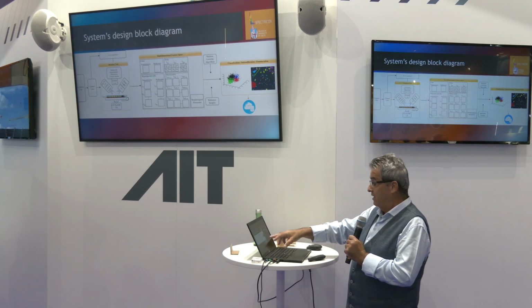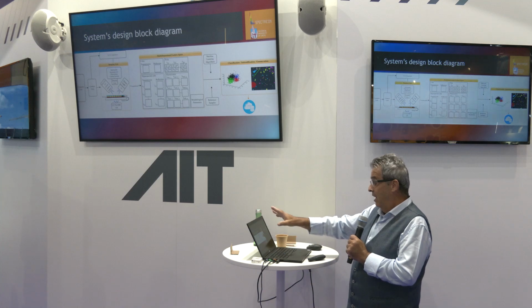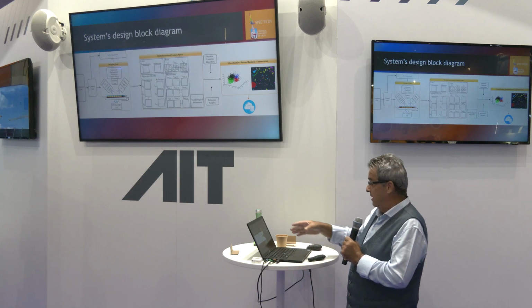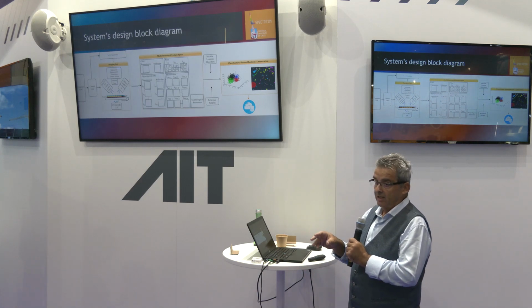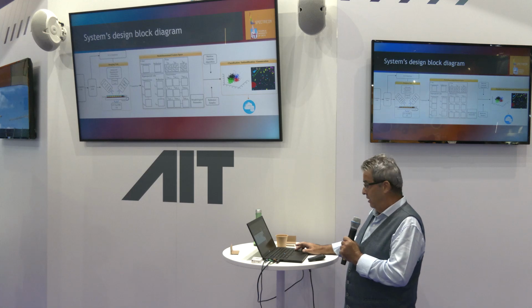And this is the block diagram of our system that has all the transmission, reflection, and polarization optics. This is the acquisition. So we acquire all these 40 images within 3 seconds. And then there's a training process with golden standard material to make chemical identity maps using machine learning technology.